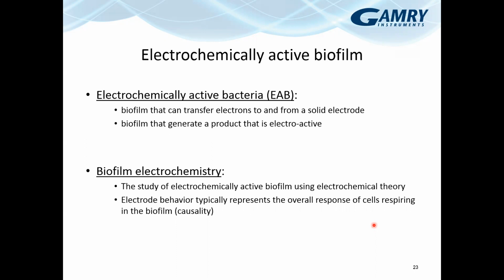And one of the things that you have to be aware of is that when you use electrochemical theory to study electron transfer of biofilms, there has to be some level of causality.